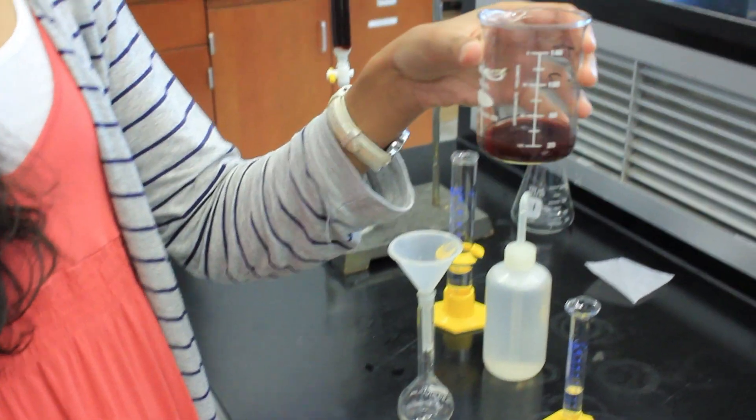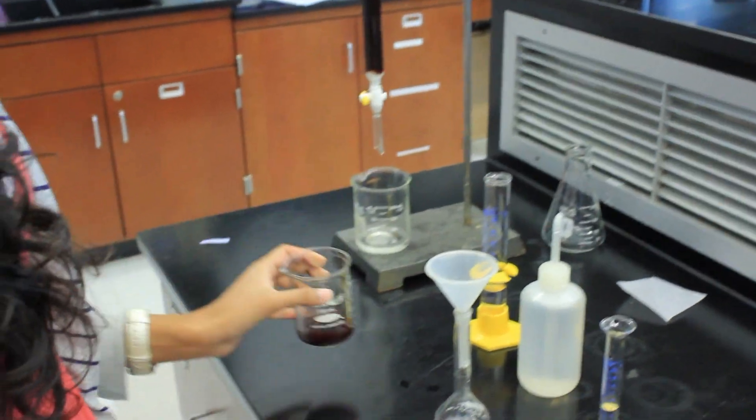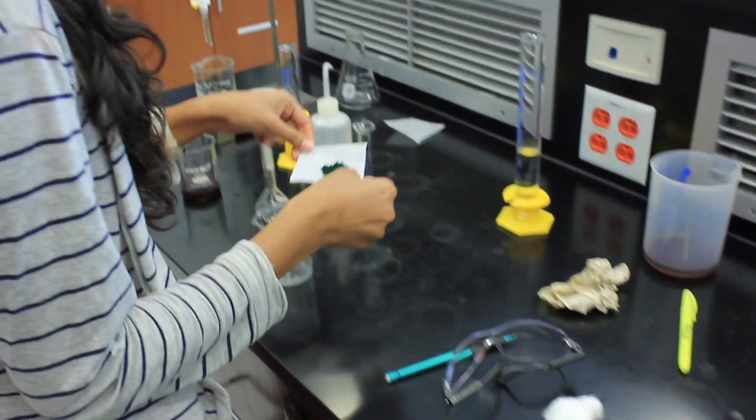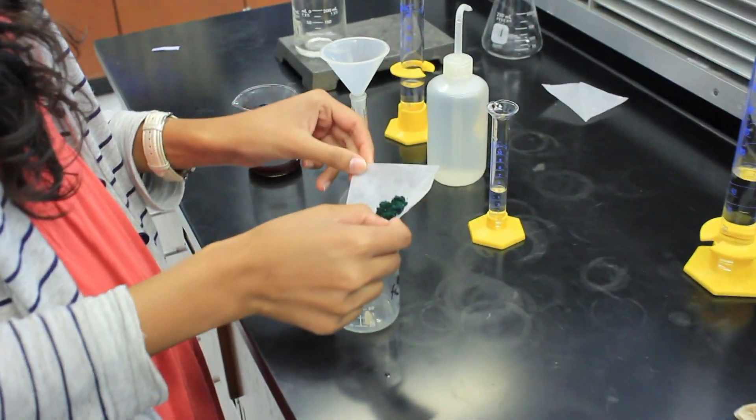Okay, so first we're going to reduce our green crystal solution. We're going to do this by adding between 0.7 to 0.8 grams of green crystals into a 150 milliliter beaker.